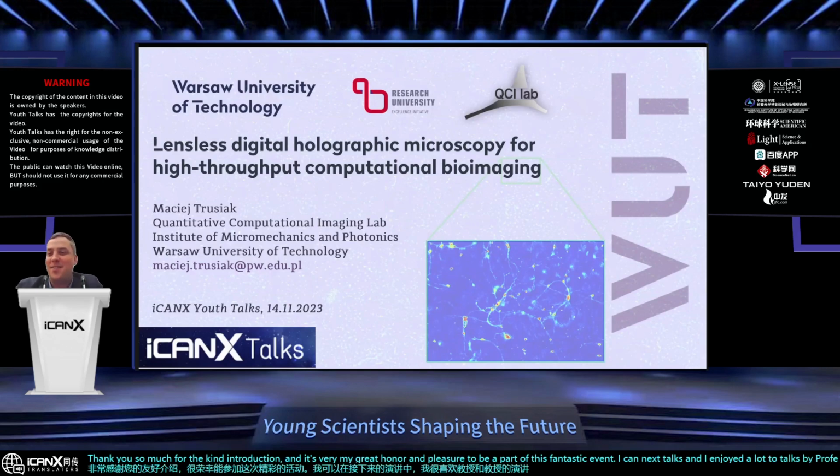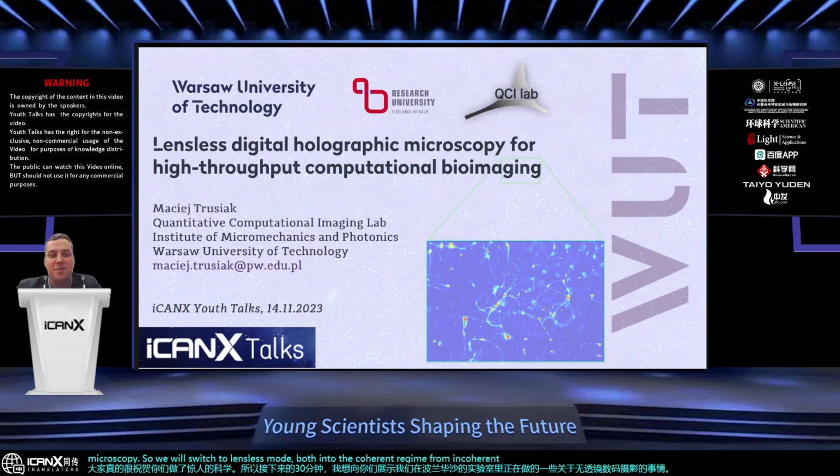So for the next 30 minutes, I would like to show you some things that we are doing in our lab in Warsaw, in Poland, on lensless digital holographic microscopy. So we will switch to lensless mode, both into the coherent regime from incoherent and reflective. So lensless, transmissive, and coherent regime.